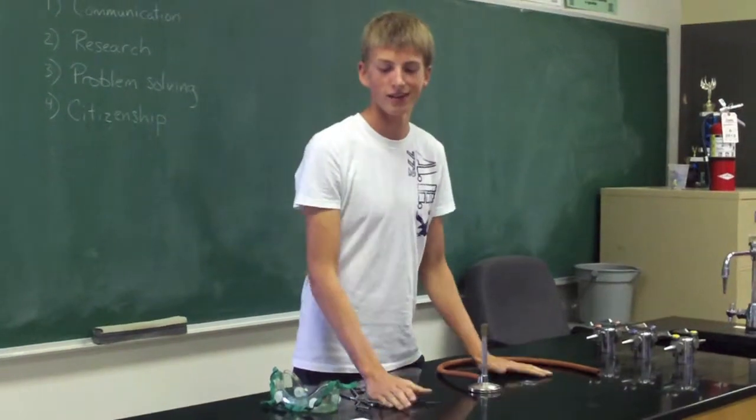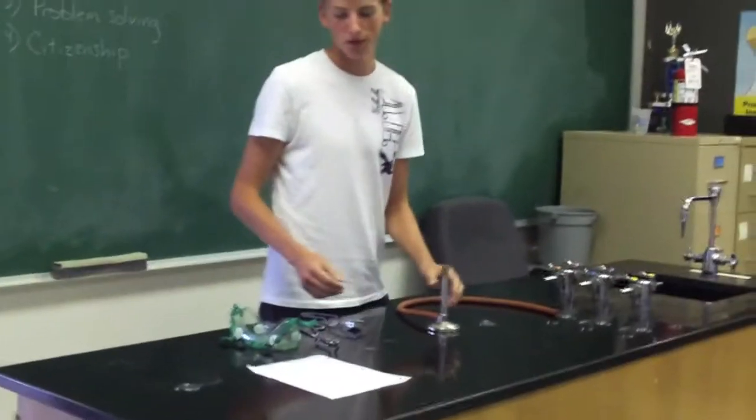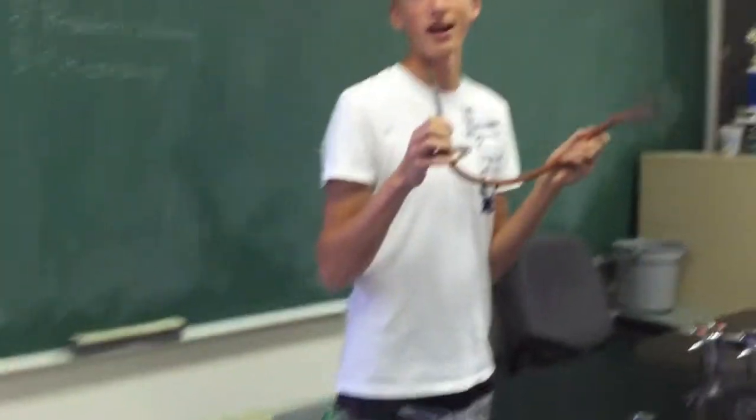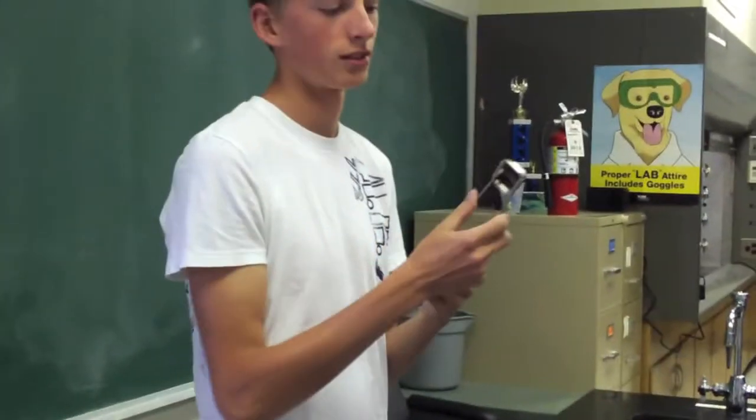All right, so today we're going to learn how to properly use the Bunsen burner. Let's go over materials first. We have the Bunsen burner itself, then we have a striker. It makes sparks and ignites the gas. We have goggles for safety, and at the end we're going to use forceps and some magnesium strips.